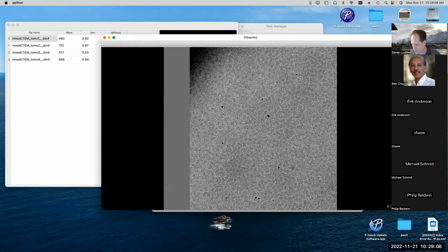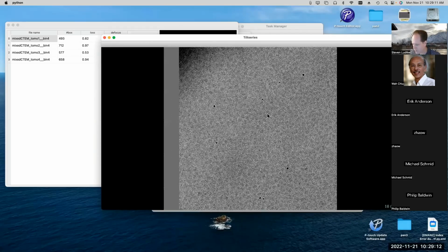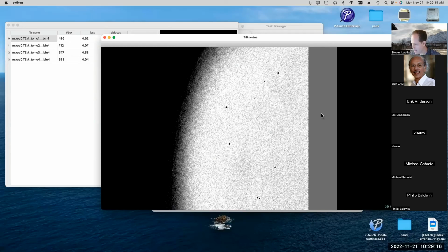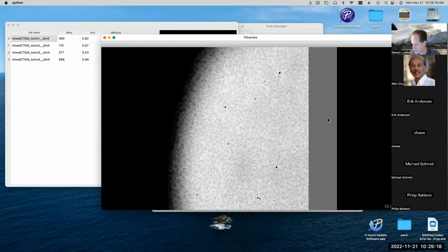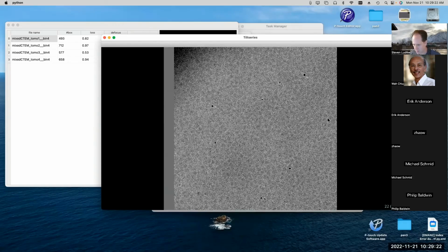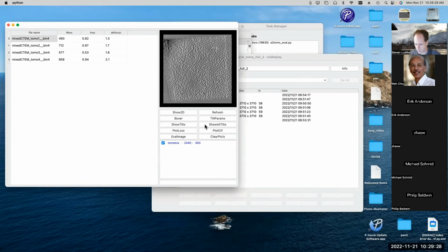Now you can still see there are a couple places where there's a little jump or something like that, and that's because there is some out of plane tilt present in these tilt series. And of course you can see the gray edges, which correspond to the misalignment that was present when the original data was collected. But you can see that looks very smooth, and hopefully if you look at the aligned tilt series, it will always look that way.